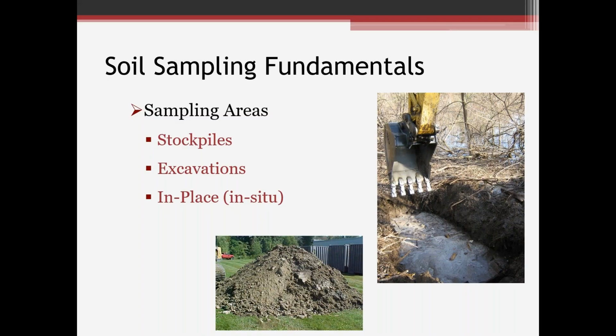Then you go into in-place soil. Okay, it's a little bit more challenging because we're probably going to have specialized equipment to sample that. If you're doing shallow samples, maybe you can hand dig those samples, hand auger or something to that effect. But when you get into the deeper depths of the area of impact, or if we're assessing deeper depths of material, we're going to be bringing in drill rigs, Geoprobe type systems, direct push sampling to grab those samples.